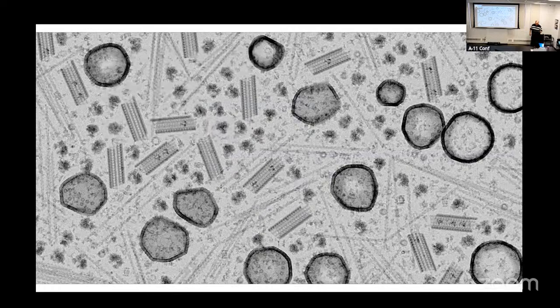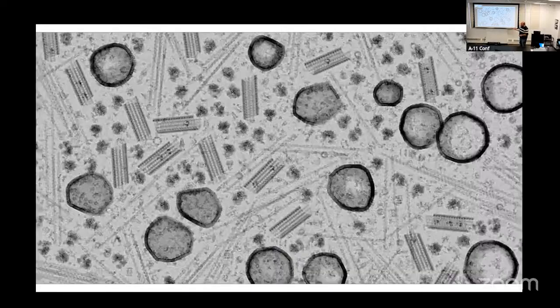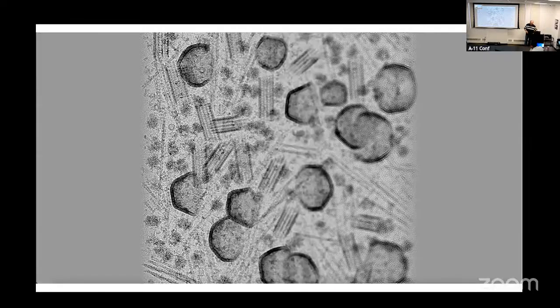Now, it's going to be a little bit laggy, but this is actually a tilt series. So a tilt series of projections through this model that CTS generated. We then corrupt this tilt series with a variety of things. One of them is a defocus gradient. As this thing tilts in tomography, you don't have a constant defocus across. You have this sort of gradient. And so you can see this is under focus and this is over focus. So this is just a high tilt.